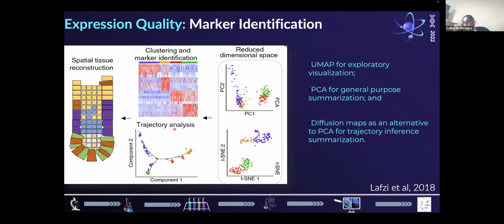Another way of doing this is to use trajectory analysis, whereby you see how cells separate. For example, if you did Plasmodium falciparum, different developmental stages from schizonts to trophozoites to schizonts to rings to trophozoites again to schizonts again. So you're going to see them spread out across. And in each of these clusters on a trajectory analysis, you can identify a particular marker that is driving that particular expression.